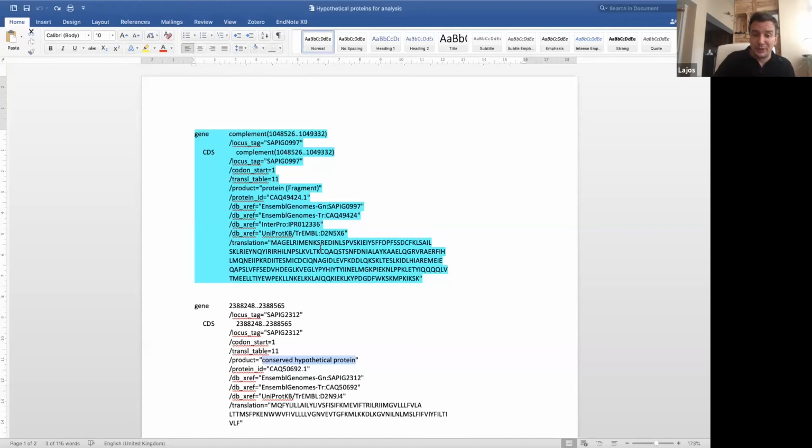So if you think about the process, what we did, for example, before when we annotated the whole genomes, you have to wait several minutes per sample. So if you want to include all the information we have in all the databases, probably annotation of just one single isolate genome would take hours. So there has to be a balance between the amount of information it can hold and the amount of time the process takes.